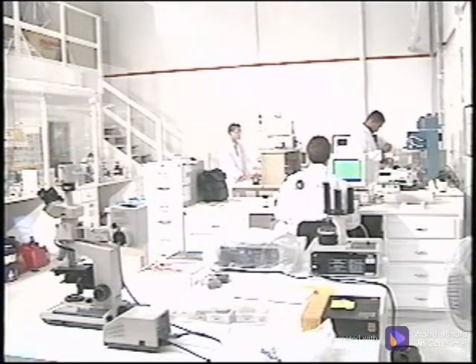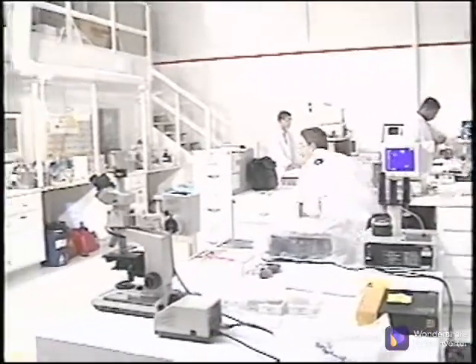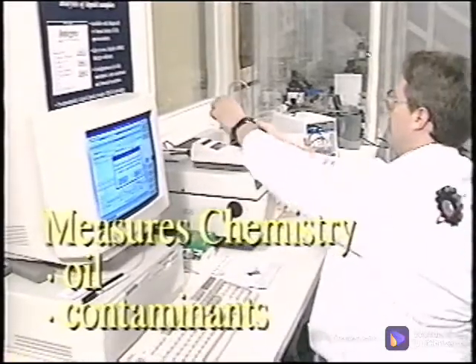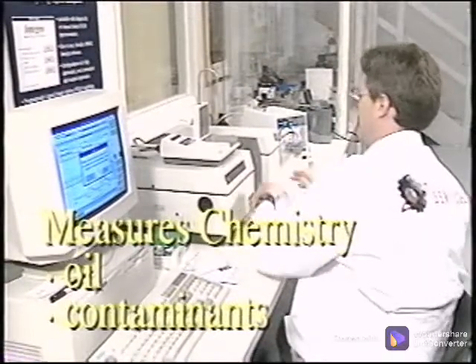When a sample arrives at a lab, it is logged into a database, recording any information you provide about the oil, the application, the process, and the equipment, including bearing types, gear types, and its working environment. The sample is then processed through the FTIR, or Fourier Transform Infrared Workstation, to measure the chemistry or molecular structure of the lubricant and contaminants within the lubricant.